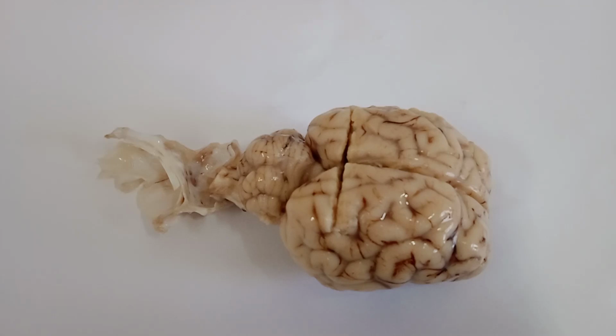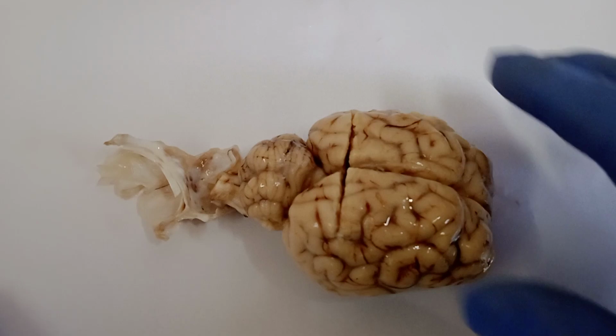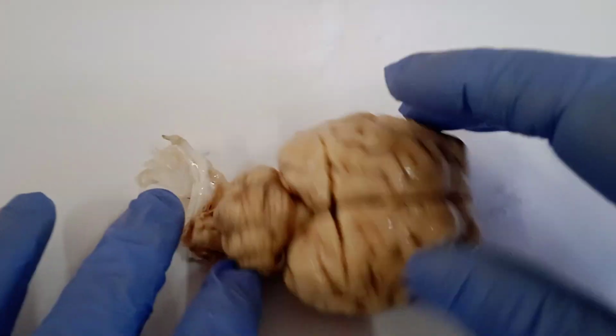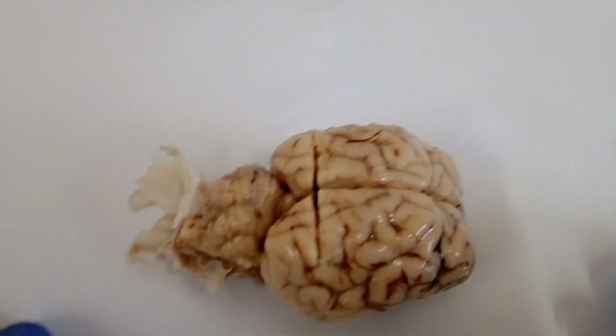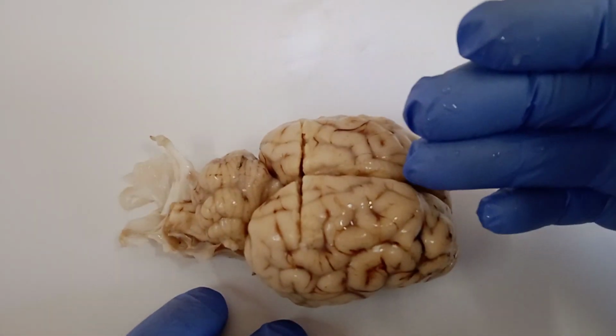Hello and welcome to the veterinary anatomy library, and today we're going to see some more features of the brain. Last time we saw the external features on the dorsal surface and on the ventral surface. So today let us dissect some part of the brain and see what are the other features that are interior to that of the brain.